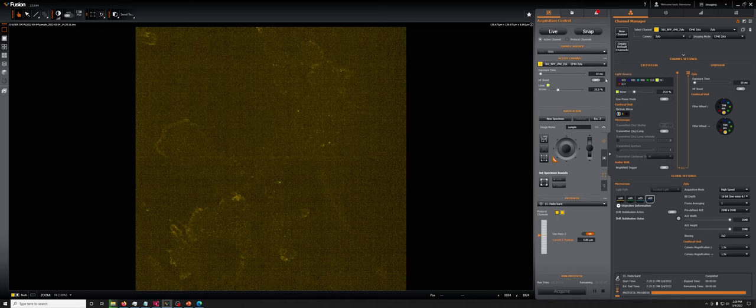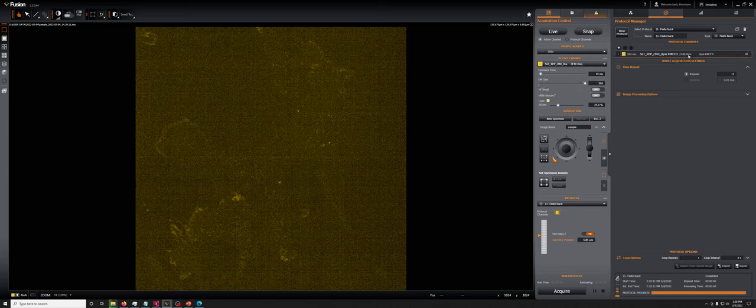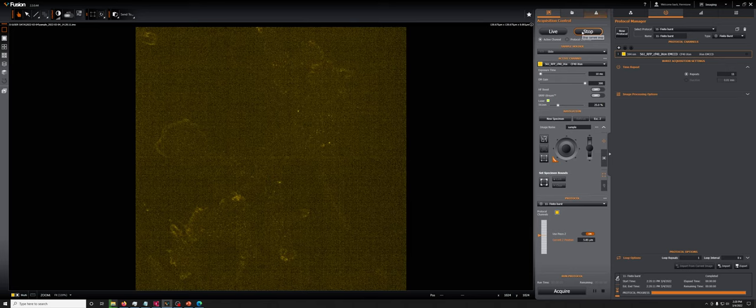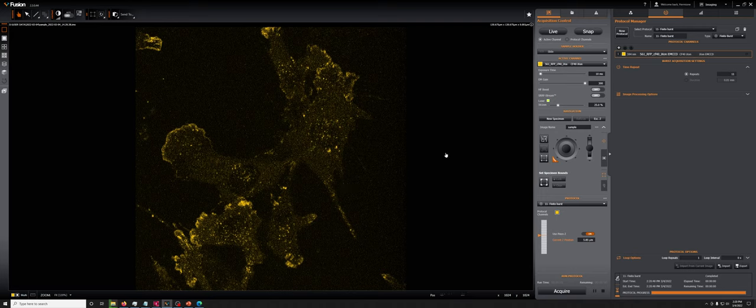The EMCCD does as well. But with the EM gain, the EMCCD crushes that readout noise. And we can get these beautiful images with really short exposure. So again, here's the Ixon image, which you can see is dramatically better than the Xyla.